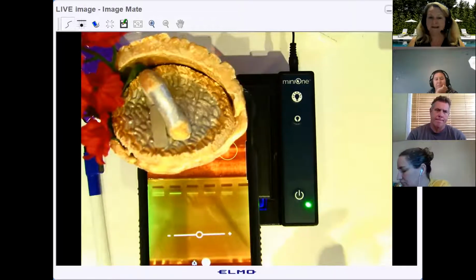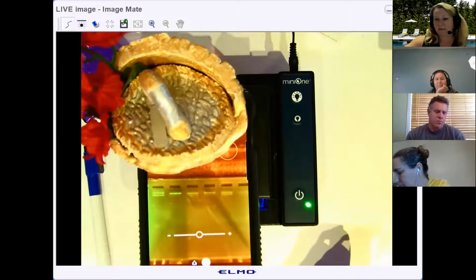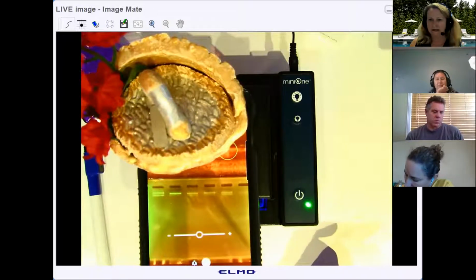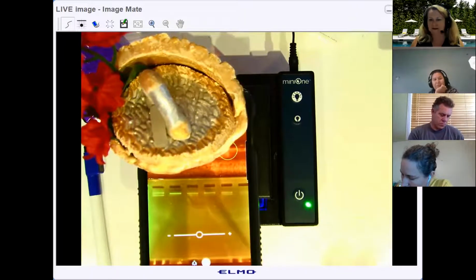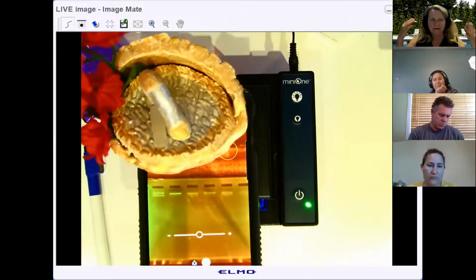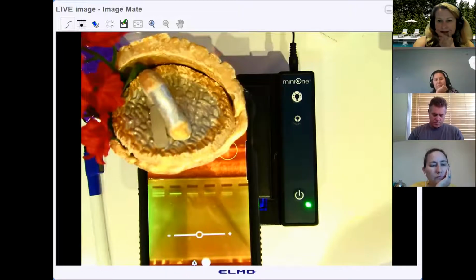And this runs so fast that if you have an extra gel cup, and I always try to get 20% more reagents than what I think I'm going to need, you can really quickly set up another gel for them to run. So all is not lost. If you're doing the overnight stain, you don't know it didn't work until the next day, and then we don't have time to run that. Anyway, I'm going to let that run.